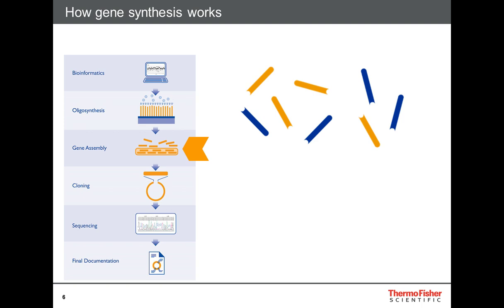That molecule then is not covalently linked, but these missing gaps of the oligonucleotides are filled in with polymerases, and after a few cycles of cycling, basically this primer extension reaction leads to full-length molecules, which can then be amplified. Sorry, now you will see the animation.